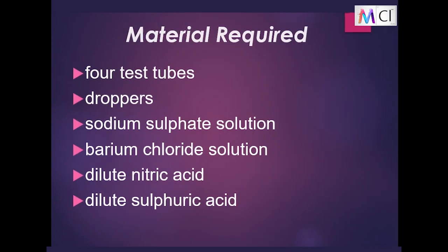Materials required: 4 test tubes, droppers, sodium sulfate solution, barium chloride solution, dilute nitric acid and dilute sulfuric acid.